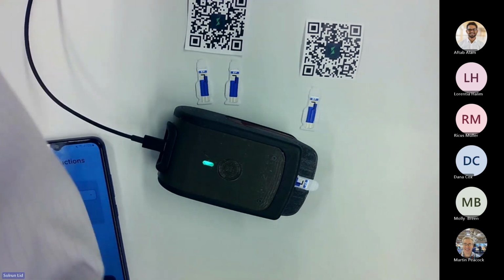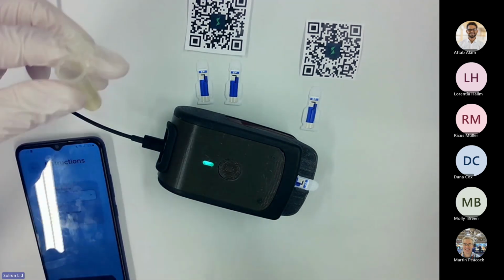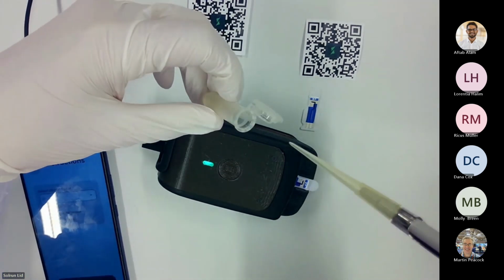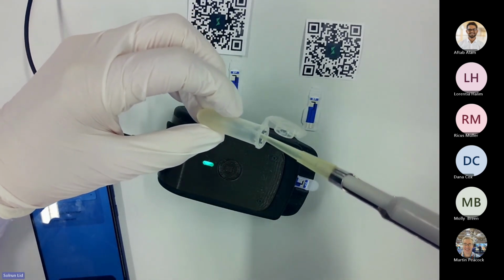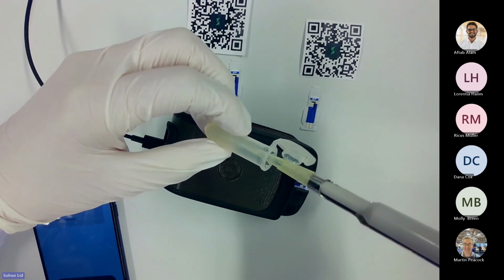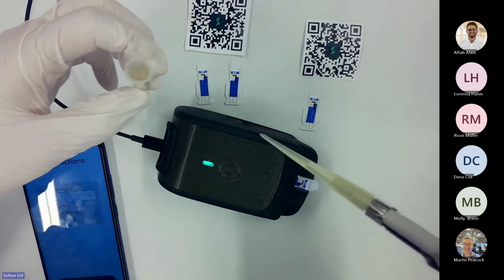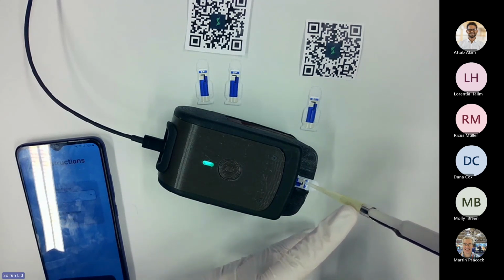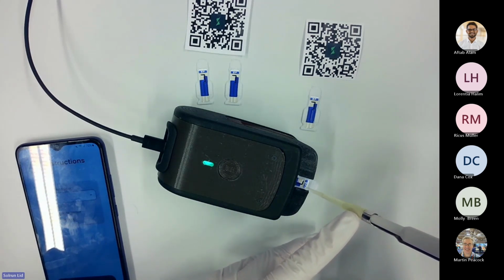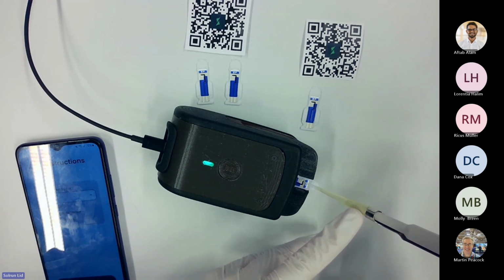And I will show you in the camera. Okay, so sorry about that. So here I'll just pipette 50 microliters of the solution we already prepared onto the sensor, onto the electrodes of the sensor. So be careful not to scratch the electrodes, the surface of the electrodes or anything.